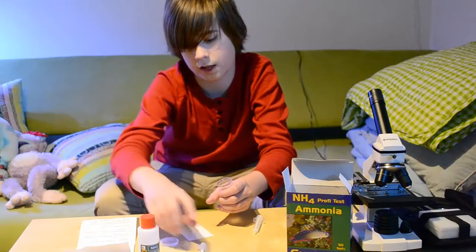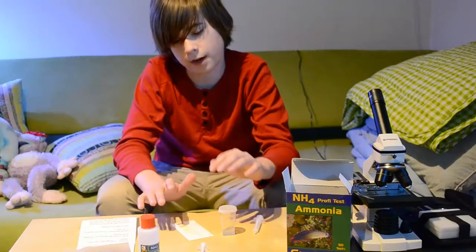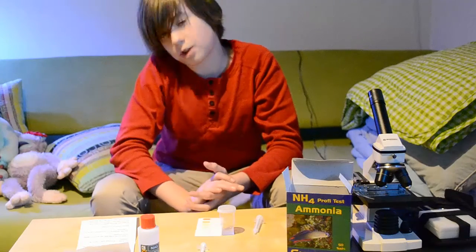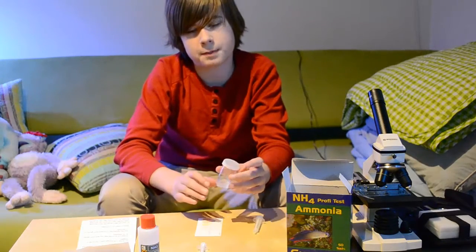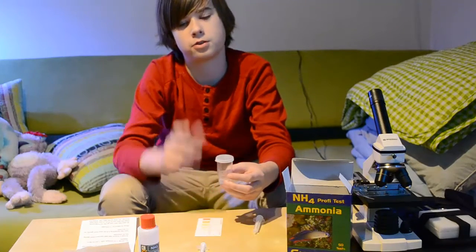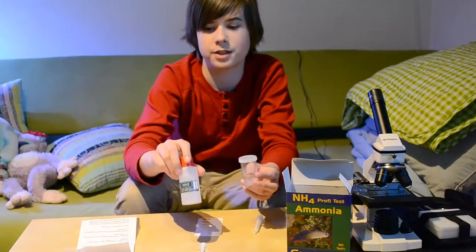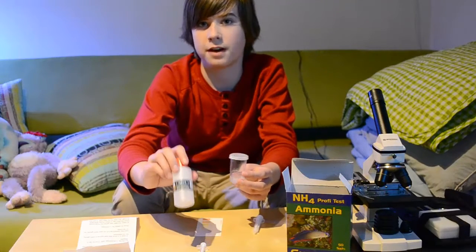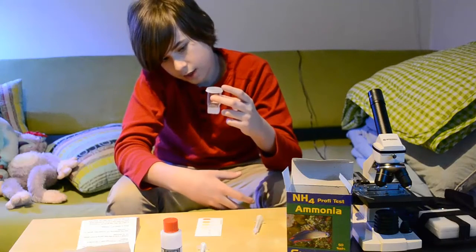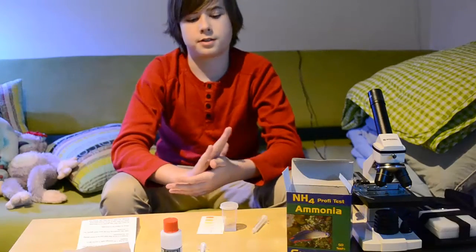Now, when you are testing multiple times, you need to remember to clean this test bottle before you use it again. This way you make sure there's nothing left over in it, because if you get an extra half milliliter of reagent in the water that you don't need, you're going to get very inaccurate readings. After I've done this test, I will of course be cleaning the glass so it's ready for the next round.